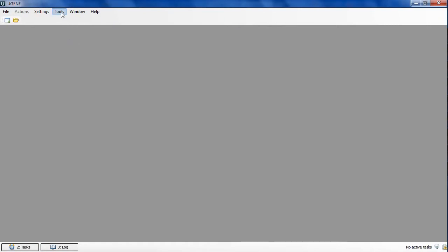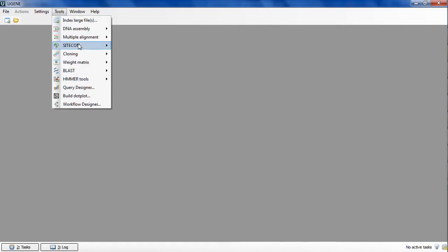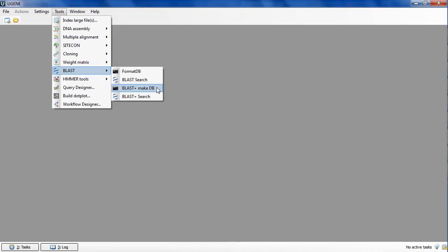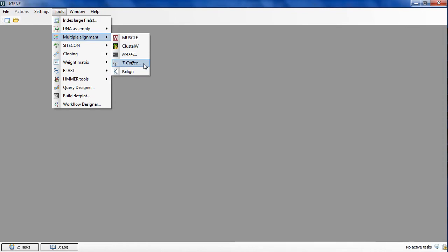The external tools support plugin's functionality was extended. There are two new external packages that we support: BLAST+ and T-Coffee Multiple Sequence Alignment tool.